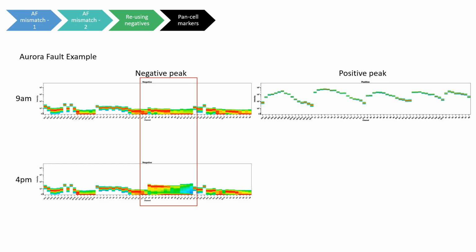This is an extreme example, but even day-to-day variation is enough to introduce differences into signature. If, however, you acquire the unstained and the stained around 4 PM, the electronic noise will be incorporated into the unstained signal and removed from the normalized signature, resulting in correct unmixing. This is ultimately why you should not reuse unstained controls.